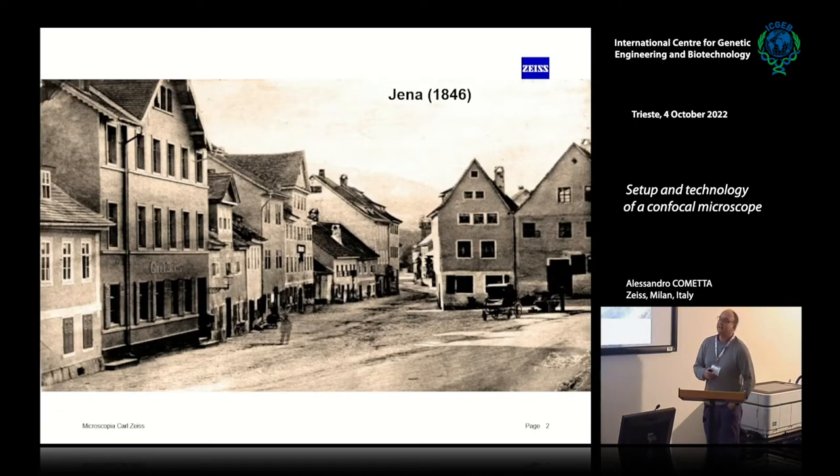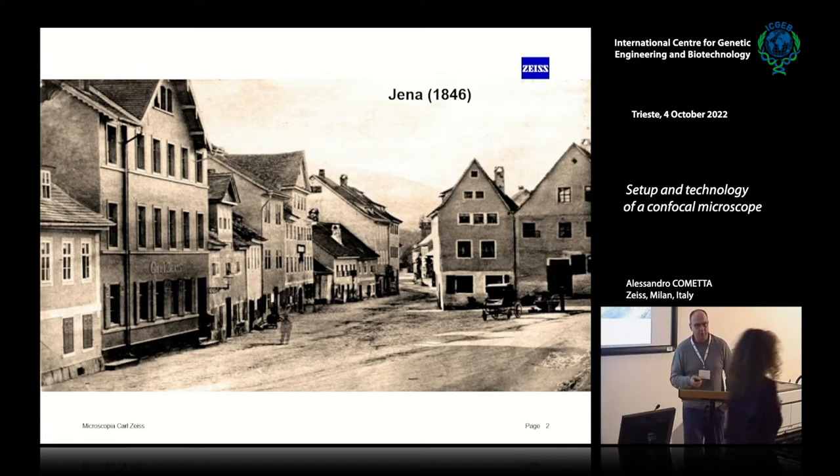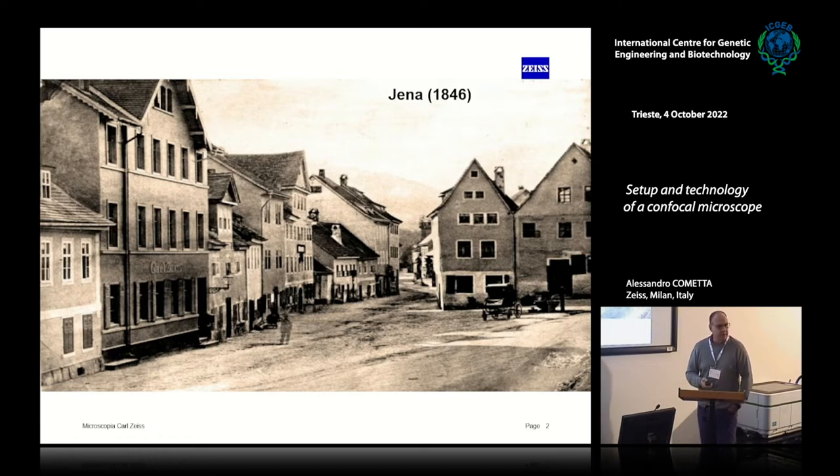I want to go back a little bit in the past, to the Zeiss foundation, when in 1846 a 30-year-old mechanic opened a small workshop for the university, and one year later he produced the first low power microscope. At the time there was a lot of chemistry. All the people were thinking that science was the solution for everything.